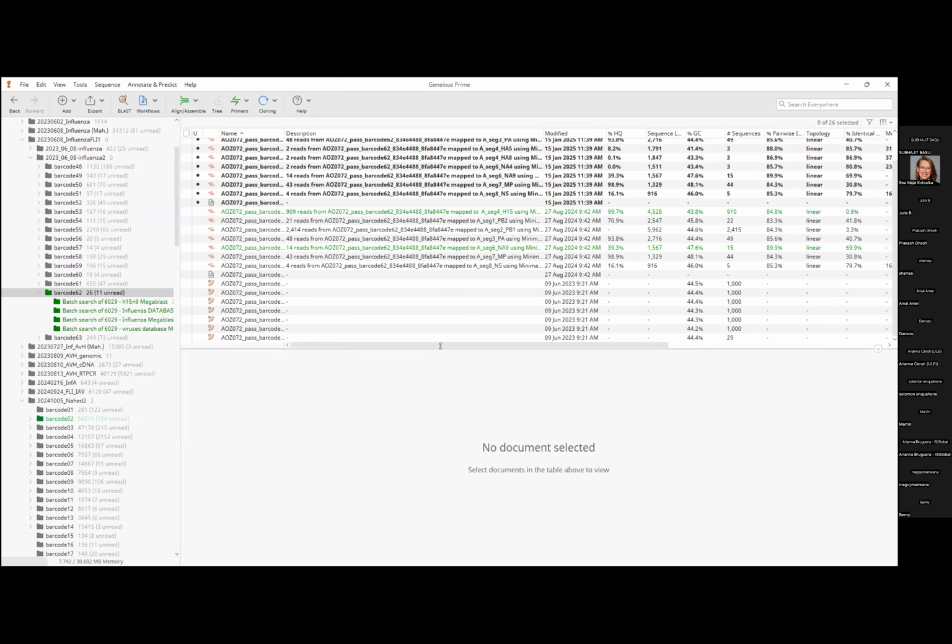4 clicks, and you will have a first set of results. You can do mapping to a reference, but of course, some of you might be interested in doing de novo assembly. So they reconstitute all of the genome of your sample after it has been trimmed, after it has been, let's say, cut to those different reads, right? So this is a very, very common scientific question.